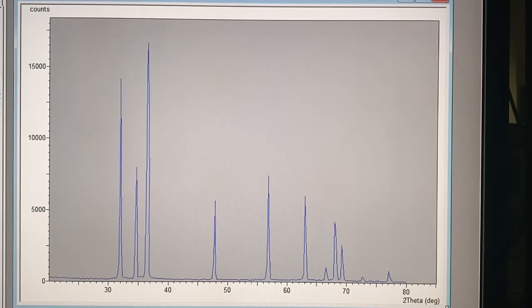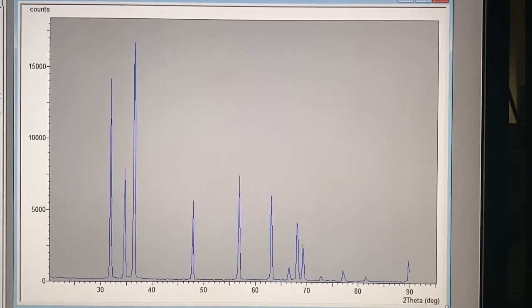In this experiment, you're being asked to do phase identification for 7 unknown samples. We have collected the actual diffraction patterns for these 7 unknown samples and have provided them through the Canvas files folder for lab experiment number 4.